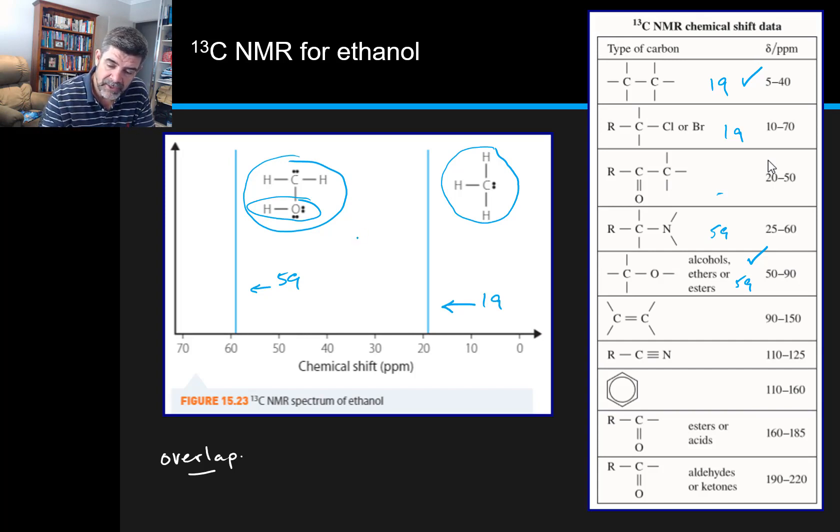What we have here in general are two peaks. Now two peaks tells us that there's at least two carbons. It's possible that if the molecule is symmetrical, and therefore the types of environments that we find for the carbons are similar. If we extended this molecule on and had our OH group in the central carbon, it may well be that that symmetry creates the same number of peaks because we've still only got two different types of carbon environments. The simplest thing to do is to see two peaks and say it's got two carbons. It's a good starting point, but you'll still need other things to confirm what you think is the case.